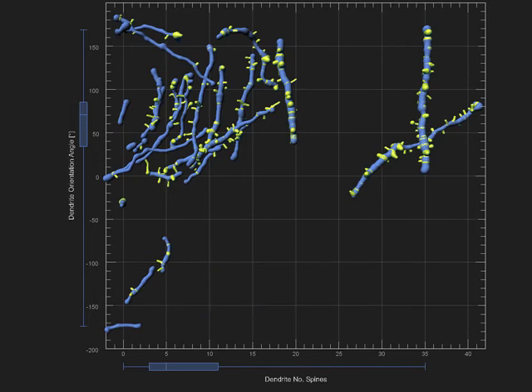A positive skew is characterized by many small values and a few extremely large ones. In this case, the box is shifted significantly towards the low values, and the whisker towards the higher values is longer. Equally, the distribution is negatively skewed if the box is shifted significantly to the high end with many large values and only a few extremely small ones.